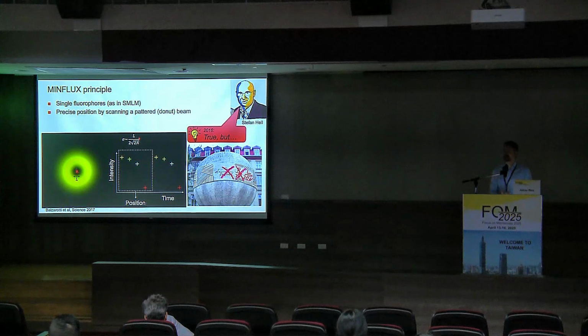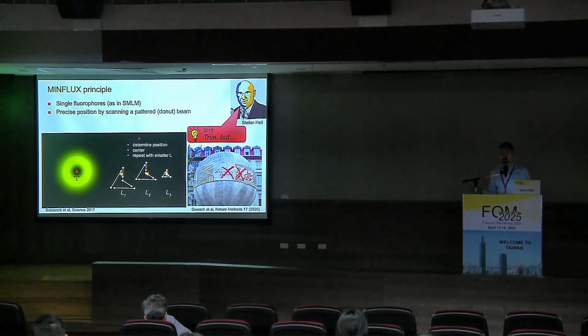On one hand, we neglected background here. That is always the limiting factor of single molecule detection and of MINFLUX. But also this equation is only valid if our target fluorophore is within the scan pattern. But at the beginning of the experiment, we don't know where the fluorophore is. So we have to start with a large L.